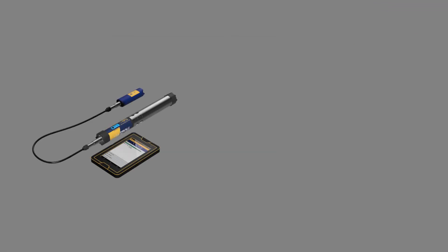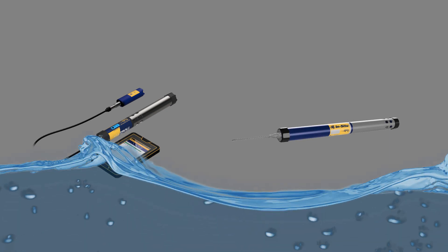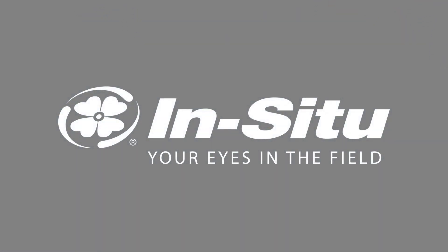The Aquatrol 500 is the newest member of the Aquatrol family of water quality instruments. Contact your In Situ representative for more information and to see the Aquatrol 500 in action.